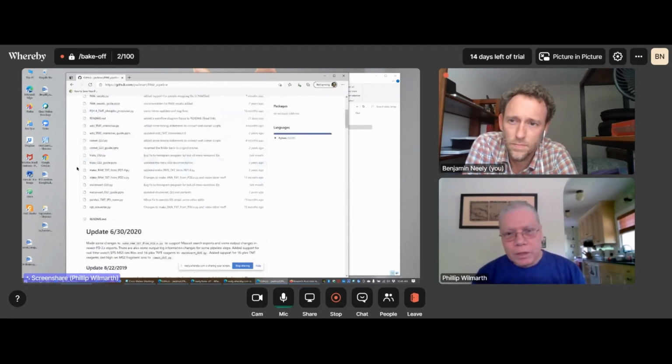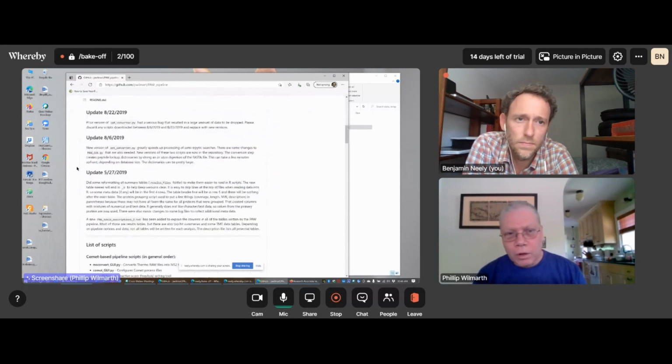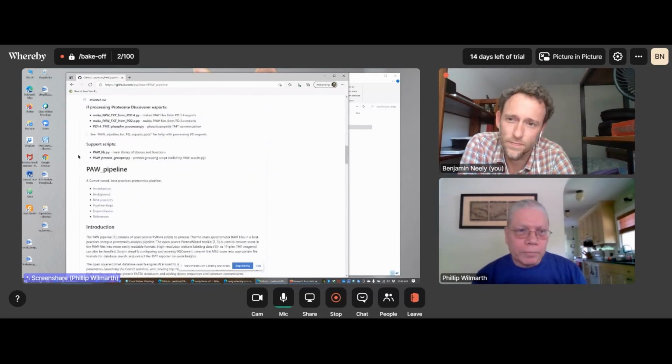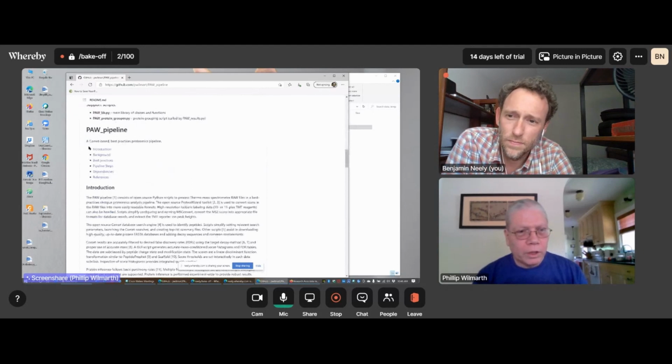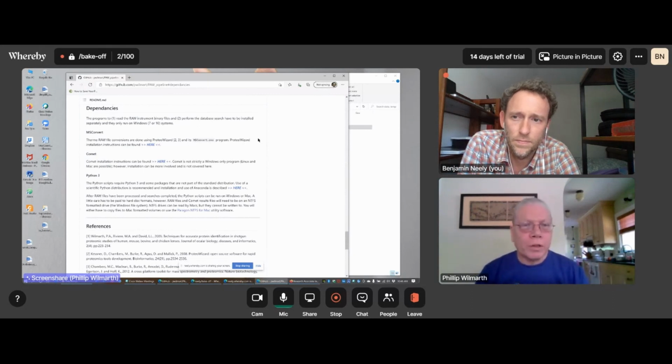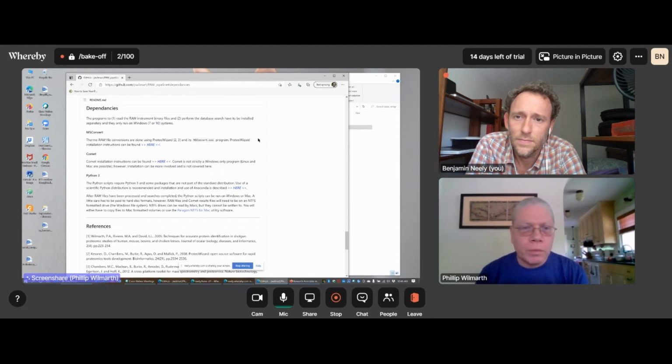We do have some software dependencies, some tools that the pipeline calls. We'll look at that. So the documentation describes those things, gives an outline of the pipeline, and has some different navigation things here, but we can go to the dependencies part. And the things that we need to be able to do, we have to be able to access our binary instrument files, the raw files. So MS Convert. MS Convert is an open source package with a variety of vendor software libraries that can be called to access the instrument files and convert them into formats that can be read by downstream tools.